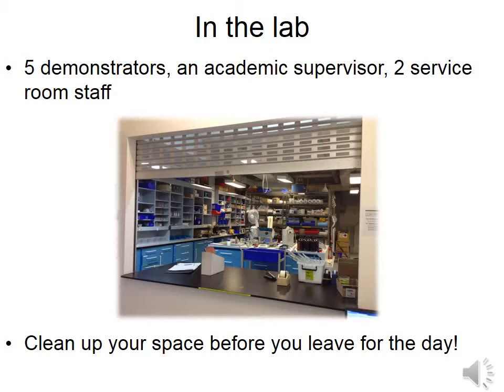From time to time the demonstrator may also gather the group together to go over some aspect of the experiment or data analysis. You must also make sure you finish with plenty of time left to clean up and to leave by 5 p.m. The lab doors shut and lock at 5:15, so you must be out by then.